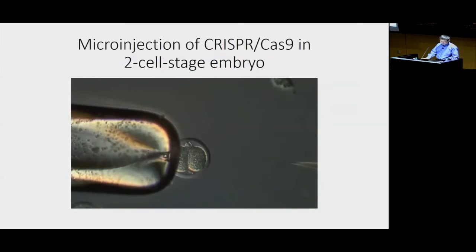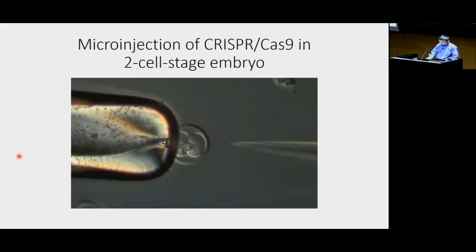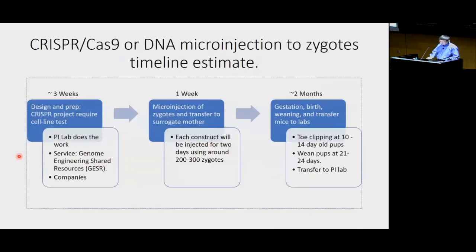Okay, that's 2-cell injection. Okay, so here is another display of the workflow, basically the timeline estimate in CRISPR-Cas9.